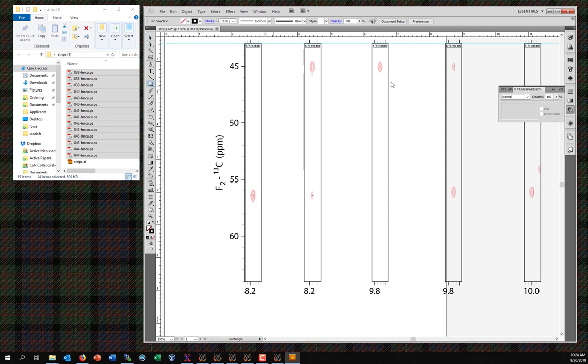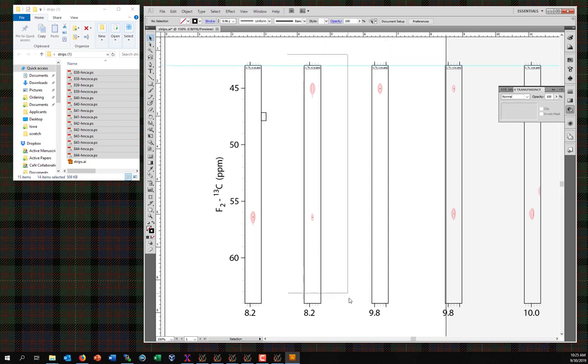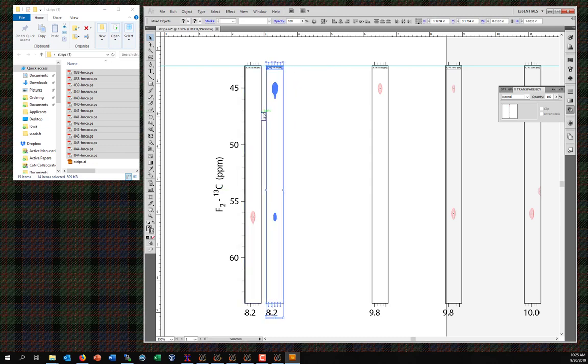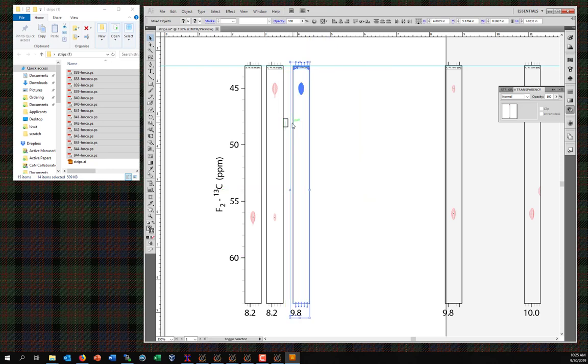Okay, so now, how do we get these things closer? Because right now it's pretty big. This is a little secret I've used many times. I basically use a little spacer element. So here I made a little rectangle that I think is going to be about the distance that I want. And now all I got to do is hold shift and use Illustrator's Smart Guides tool to basically help me position my strips so that they're close together. And in this case, I wasn't quite as close as I thought I was going to be. So we'll touch it up. There we go.